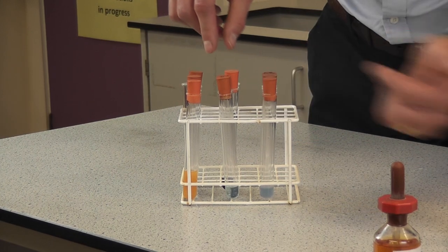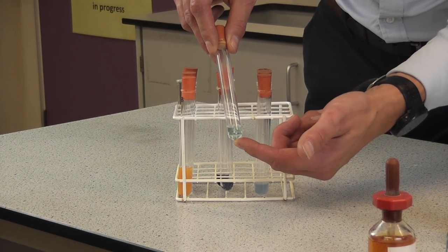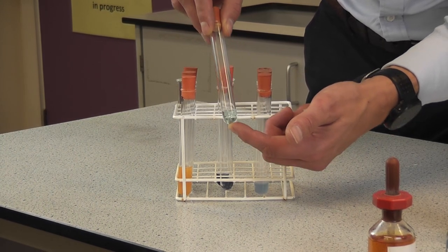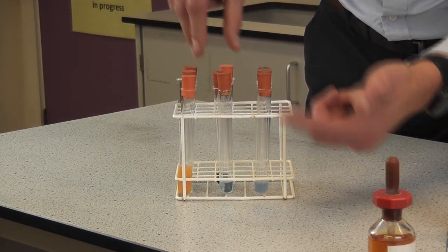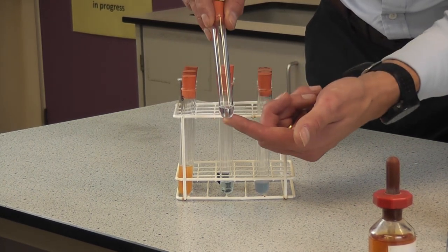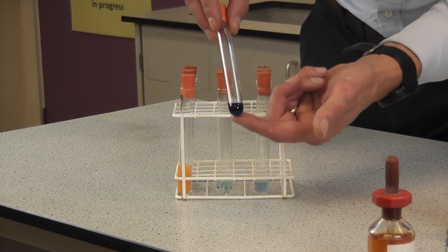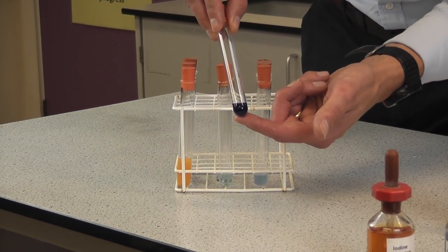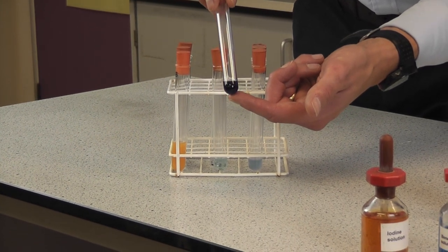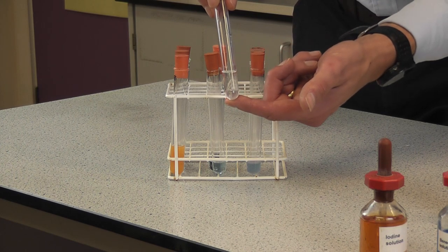Moving on to our white bread: we had a negative test for sugars. For proteins, also a negative test. But for starch, as we would expect with bread, we've got a definite positive test. And a negative test for fats.